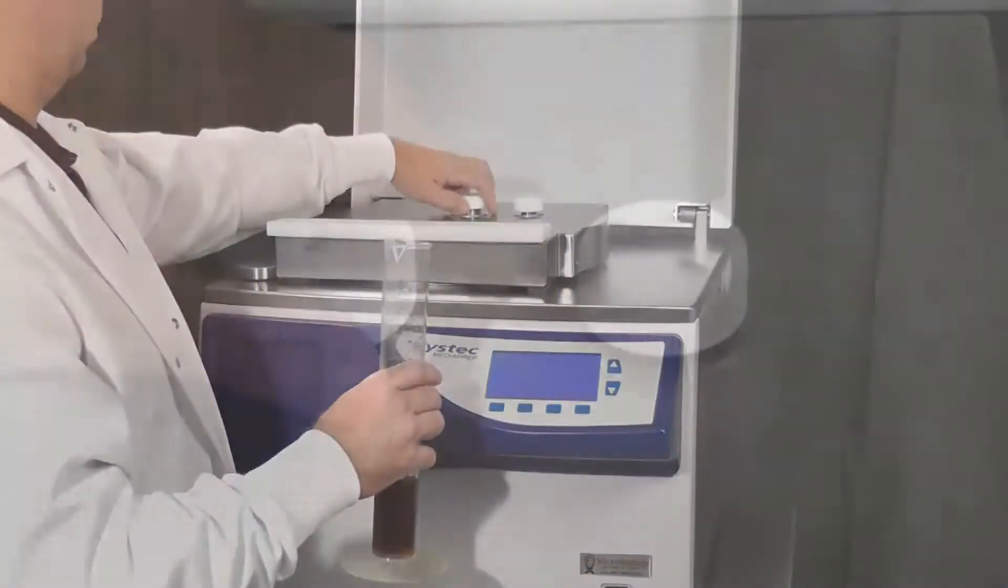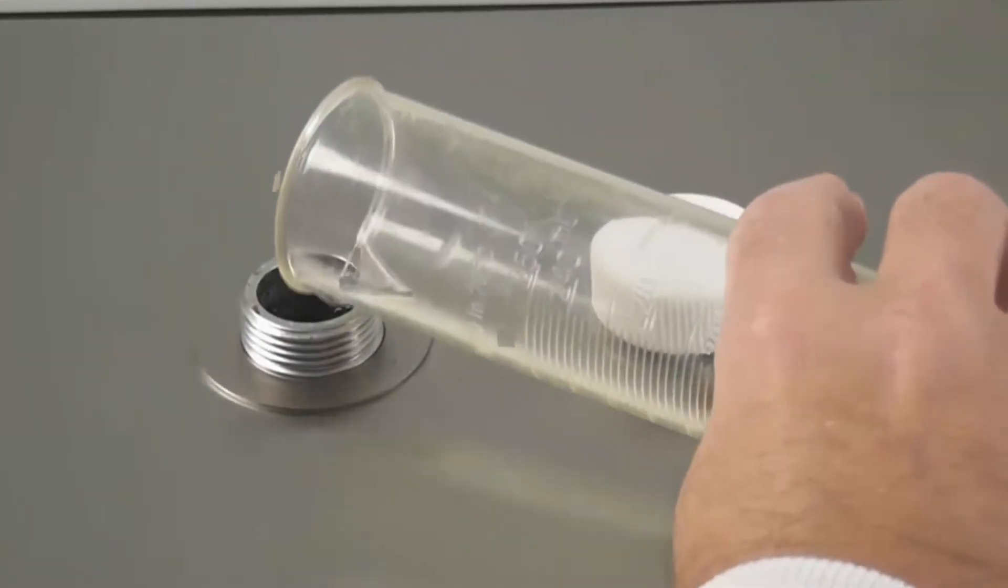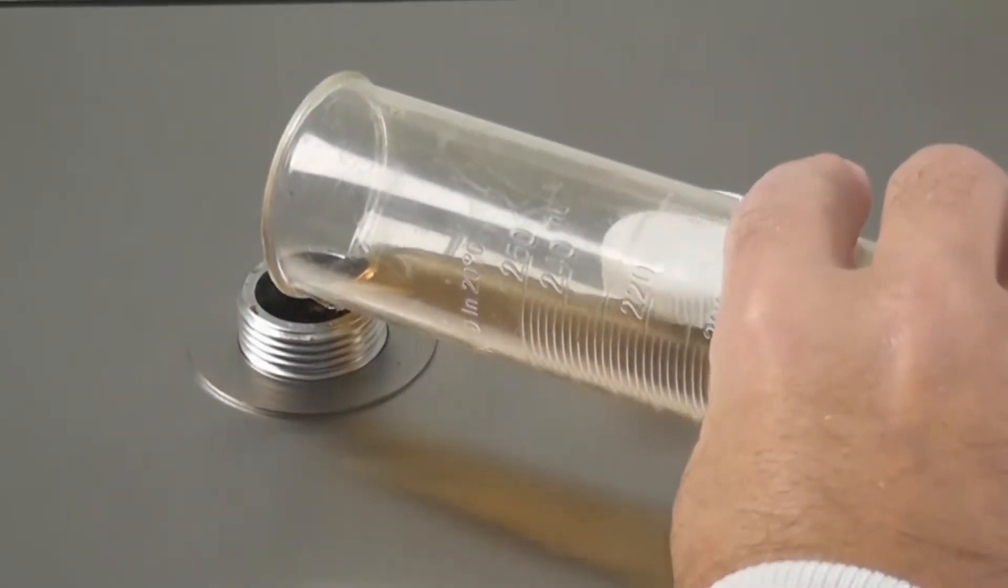If you wish to add thermolabile products or other additives after the sterilization cycle, simply remove the filling cap and pour your materials into the sterilization chamber.